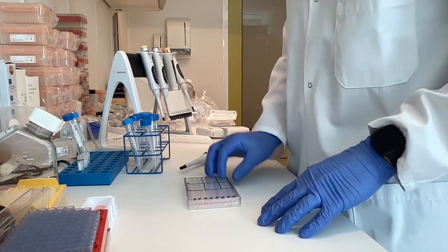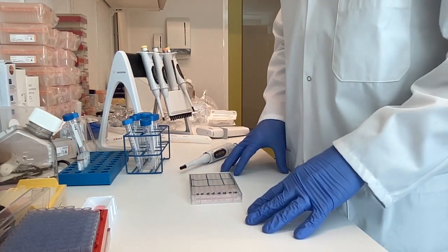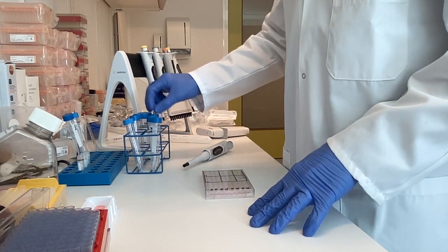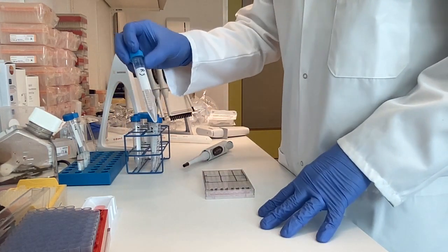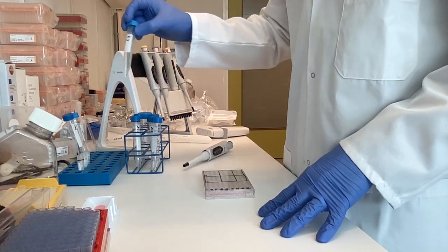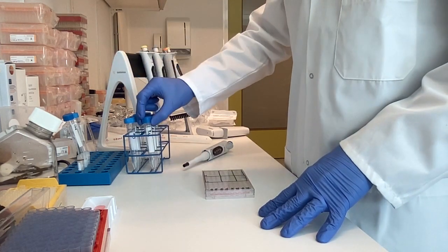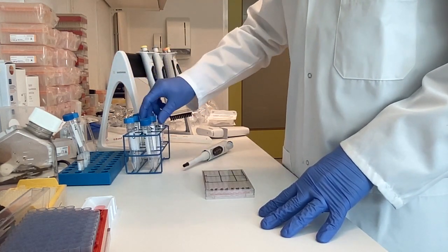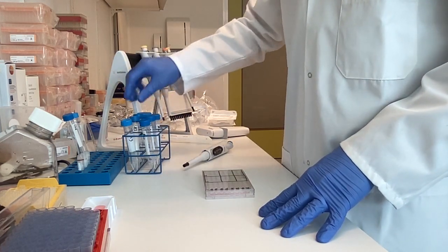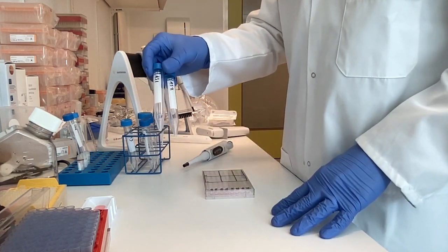So in this video I will show you how to prepare the product samples, how to make spiked product samples. For that I prepared a couple of tubes. We're going to make an R3 tube, so that's the R3 concentration of your LPS curve. An R4 to make serial dilutions. Then I prepared two tubes for your two product samples, A1 and A2. And I prepared two tubes for the spiked samples of product 1 and 2.